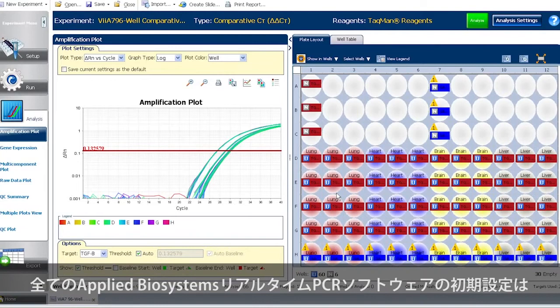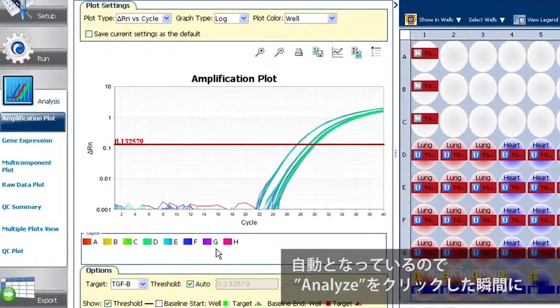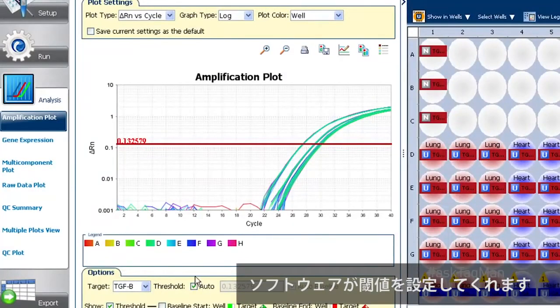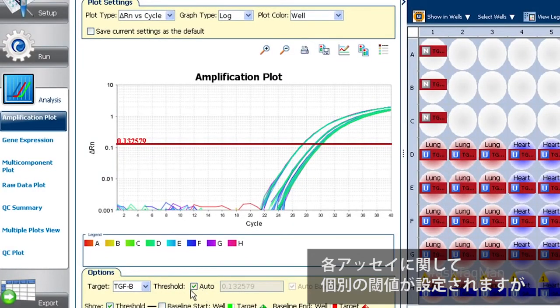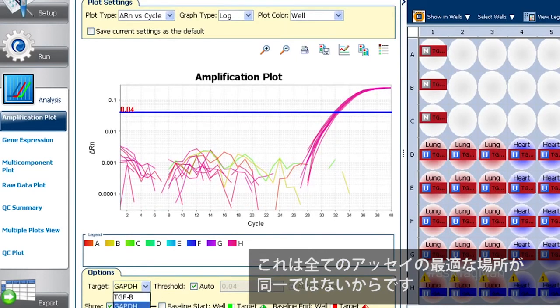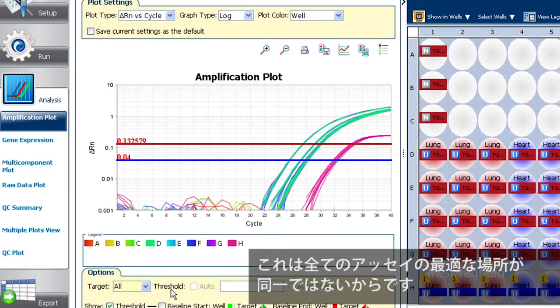The default on all Applied Biosystems real-time PCR software is auto threshold, meaning the software sets thresholds for us the second we click Analyze. Notice that it sets a different threshold for each assay separately, which is good since not all assays have the same sweet spot.